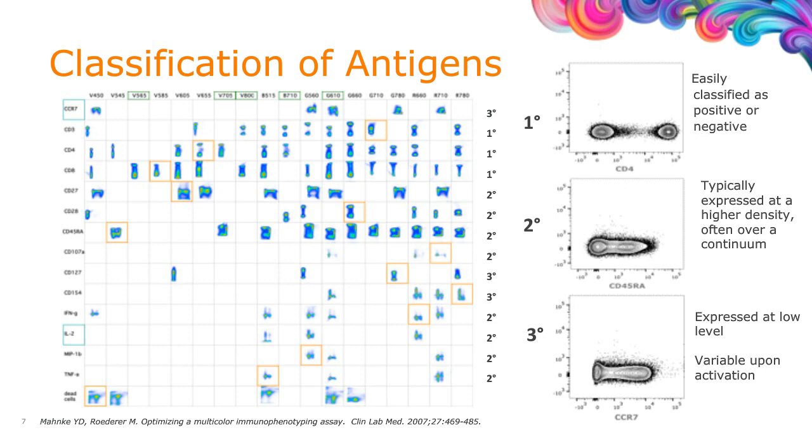Those primary ones, if every antibody specificity was primary, flow would be considerably easy to do if it was like a CD3 and a CD4. But many of the specificities, like CD45RA, exhibit a secondary receptor type, such that there's a continuum of expression, meaning there are many different subsets within CD45RA.